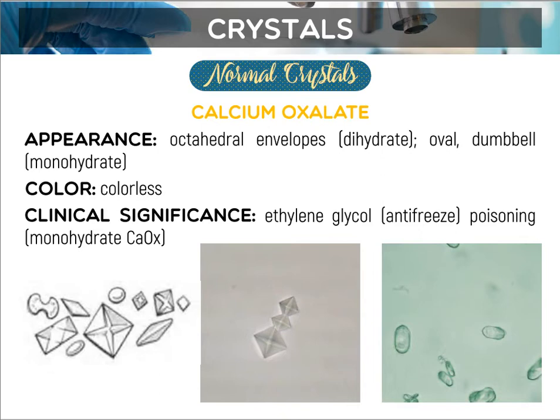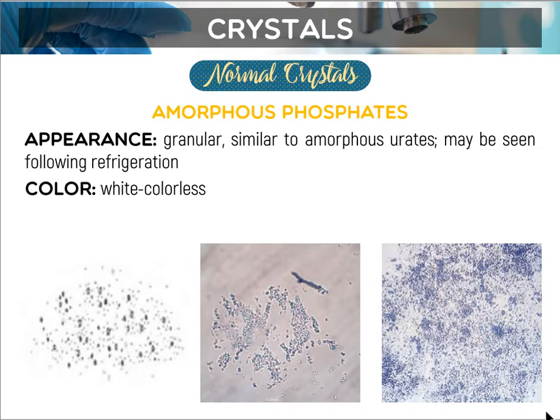So if makakita tag clumps gani guys, clumps of your CaOx, this may be because of renal calculi. Because your calcium oxalate, your CaOx, is the major constituent of your calculi, okay? So take note, if fresh urine pagkita nato daghan siyang clumps of CaOx, possible na magka kidney stone si patient or undergoing kidney stone siya, okay?